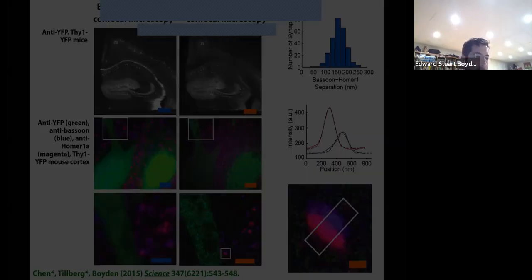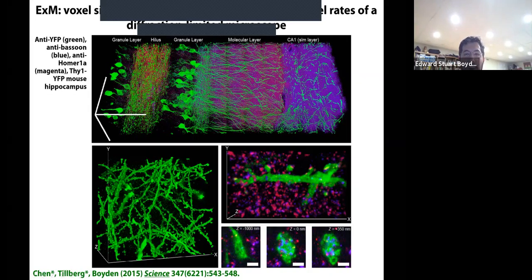So to summarize, we've discovered that we can physically magnify objects. You can take a specimen, polymerize a dense hydrogel throughout it, soften it, and expand it evenly. And so it lets you do multi-scale imaging. You can look at a brain circuit and zoom in all the way to a single axon, synapse, or dendrite with great precision. Furthermore, this means that ordinary microscopes that most people already can access are now nanoimaging devices. We kind of upgraded every microscope out there to improve its resolution.